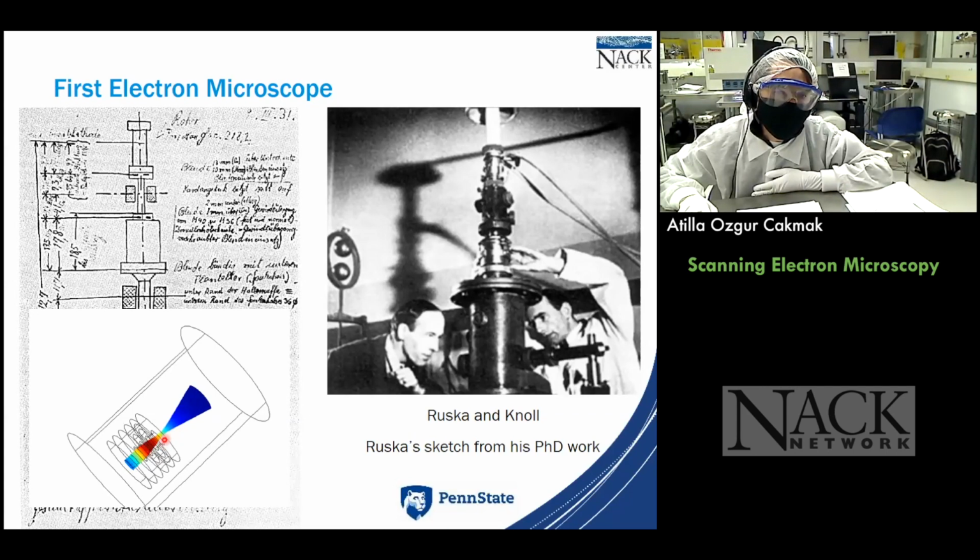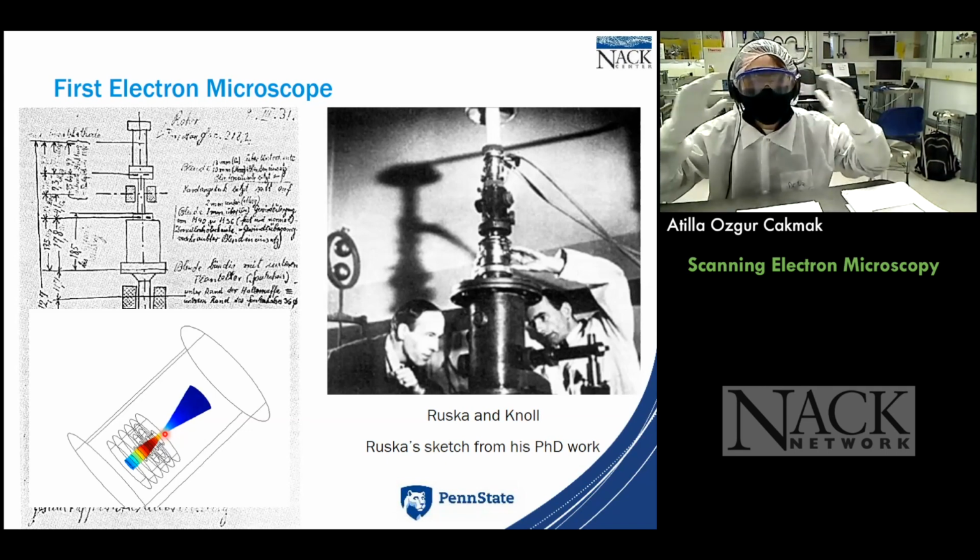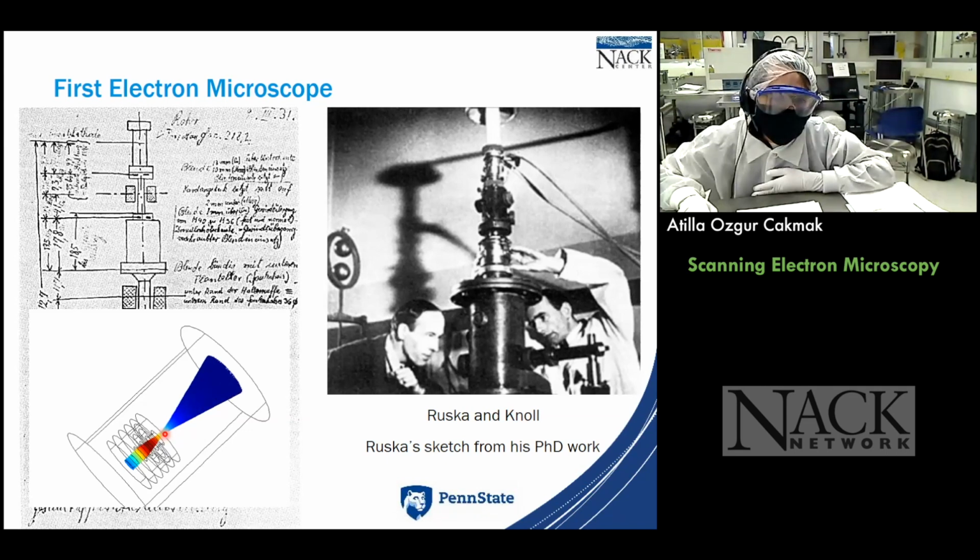This is my electron beam, and it's being sent from this end, and it's going to the other end. What do I see? I see that I can focus the beam at this point here. With what? Not with lenses anymore, like the conventional optical lenses. I will use what we call electromagnetic lenses, or simply put, magnetic lenses. Magnetic fields will be able to focus the beam.